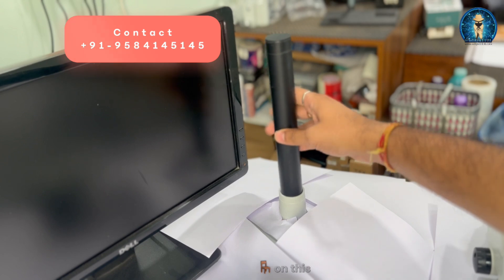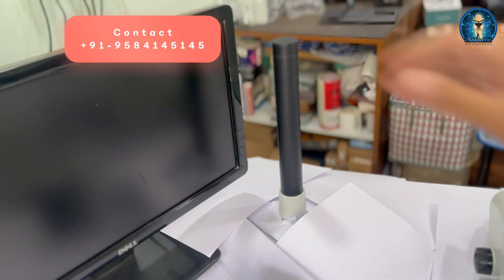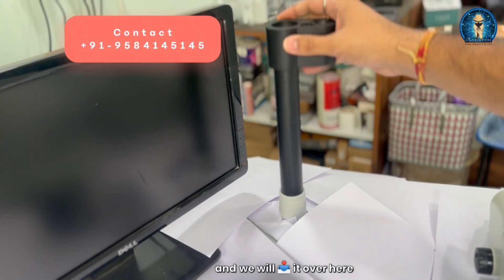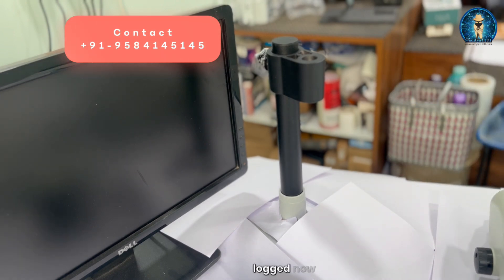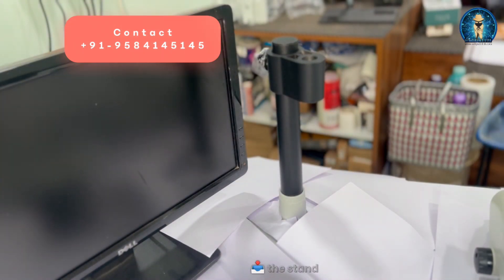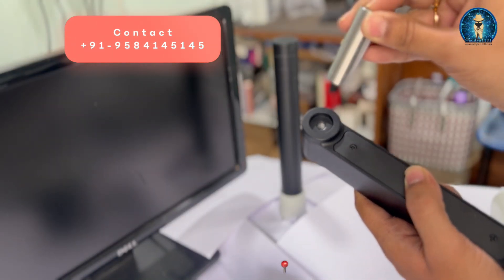First, we are going to mount the stand on the holder — the holder will be mounted on your table. You can see the stand has been mounted. The second step is to use this holder, put it in position, and lock it with the knob. Now the next thing is preparing our stand — we will be putting the stand here with the help of a screw.